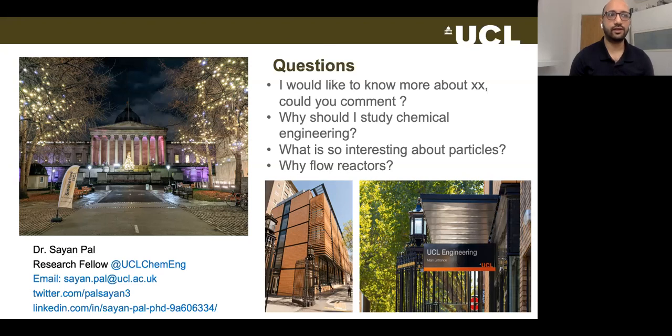And when there is a requirement to go to an industrial scale, we can always use parallelization or milli reactors to reach the gram per day scale or even kg per day scale. Some of the reactors I showed in the presentation, some of the micro reactors, milli reactors, and the impinging jet reactors were used to make chemicals or drug nanoparticles or other types of microparticles at more than a gram per hour scale, which is pretty industrially relevant.